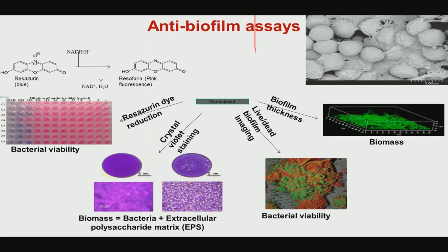Now, these are the scanning electron images. This is the SEM image of the biofilm. As you can see, these are spherical-shaped Staphylococcus species, either S. aureus or S. epidermidis, and there are some ECM-like features which are not very dense, but more like a porous surface layer which is forming, and which connects these spherical species. This is a polysaccharide-rich biofilm which is formed on this material substrate.